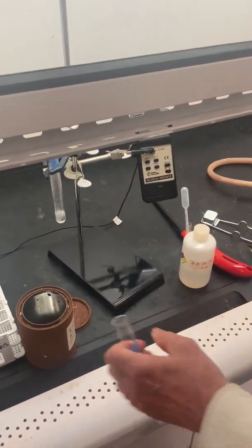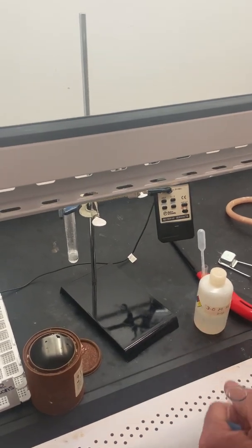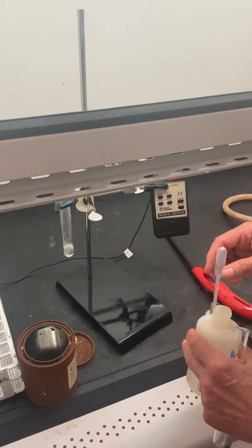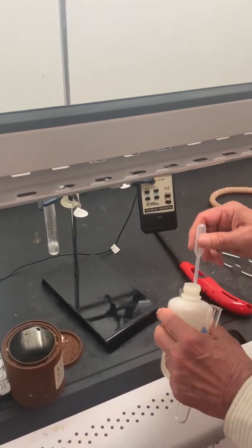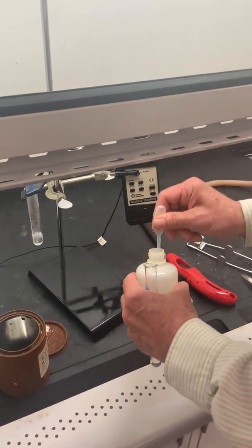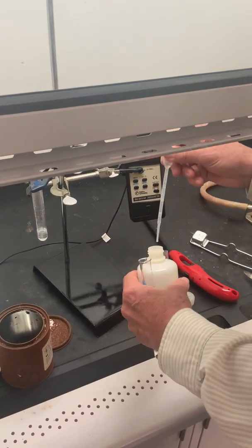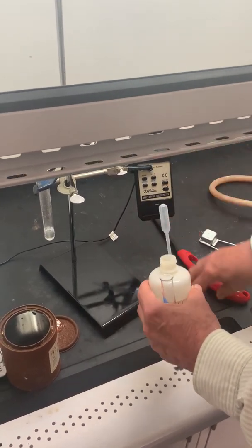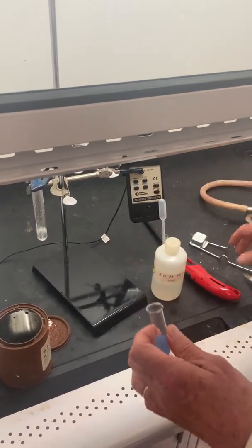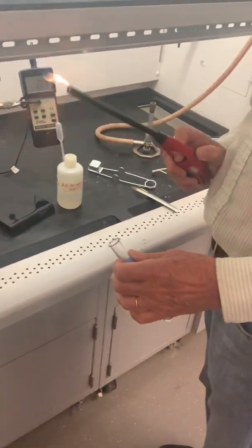which is a combination reaction. Sixth reaction, sorry. Combination reaction. This one's much trickier to do on video. You really have to be here and have a lab partner to help you do these things, because I'm going to do the same reaction number 5 between the HCl and the Mg, but then I'm going to provide a little additional energy, maybe.